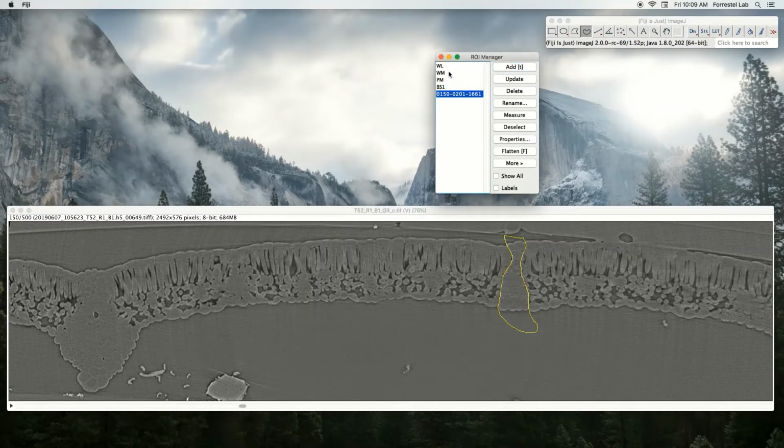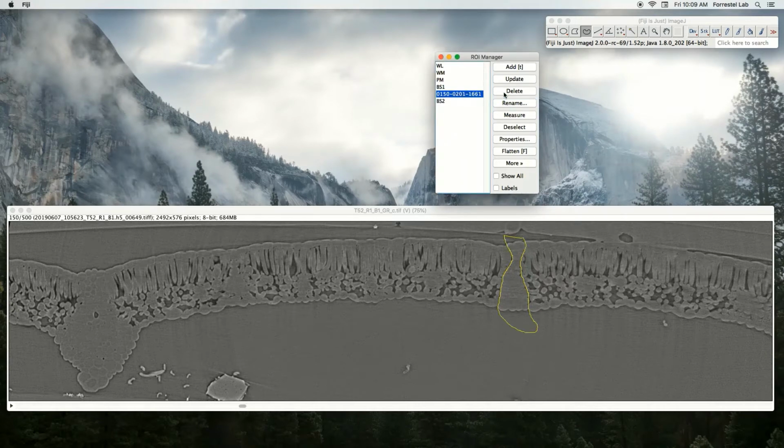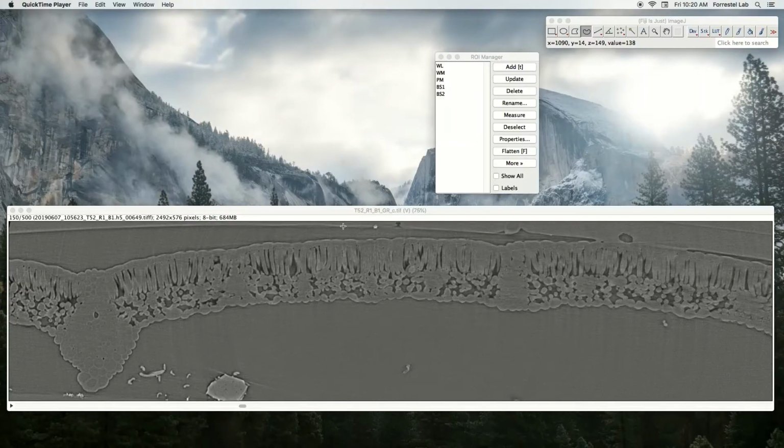So we're doing this on the grid image and not on the combined threshold image because it's much easier to see the individual parts. As you can see, a similar intersection was used for the bundle sheath. Okay, next are the veins.